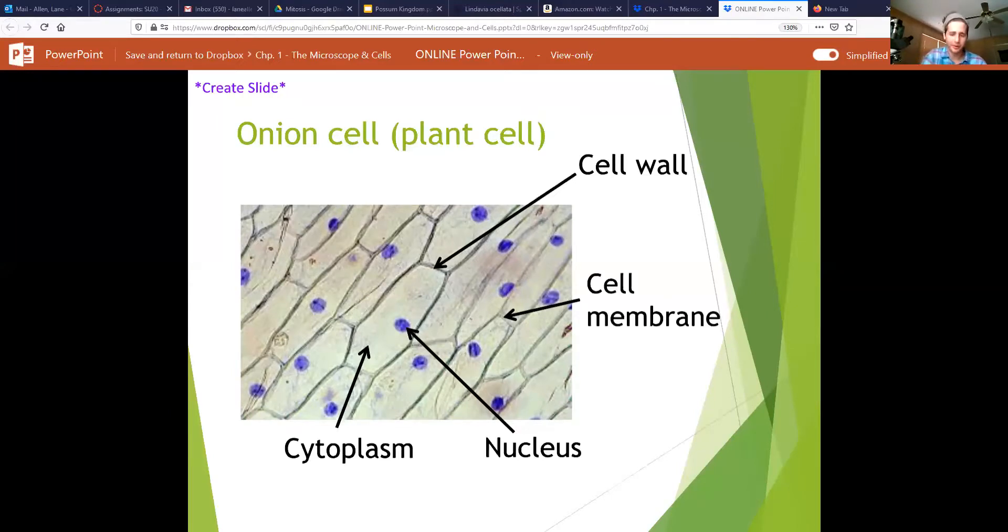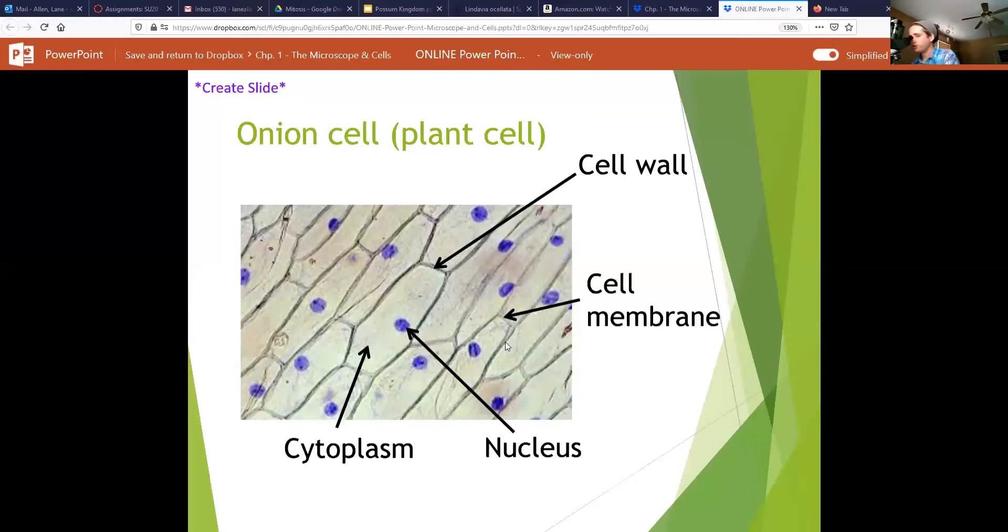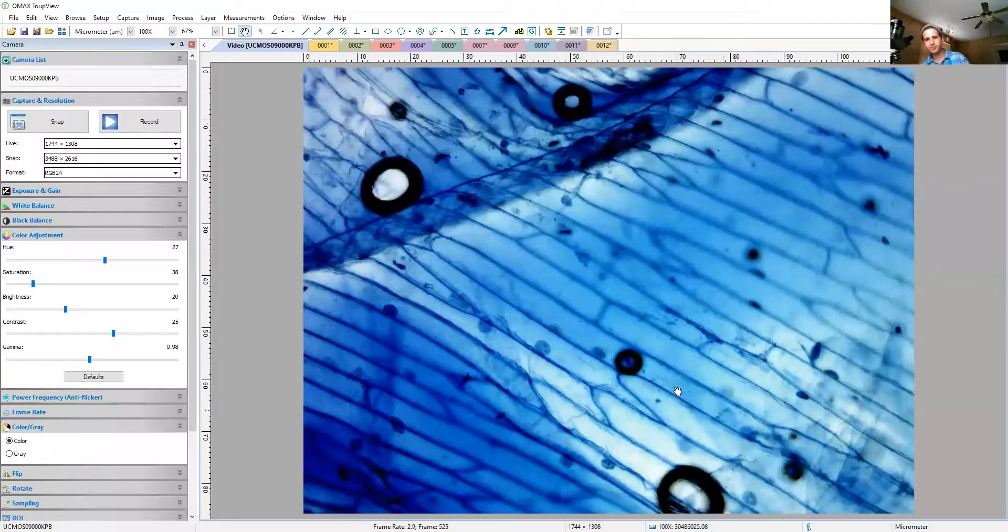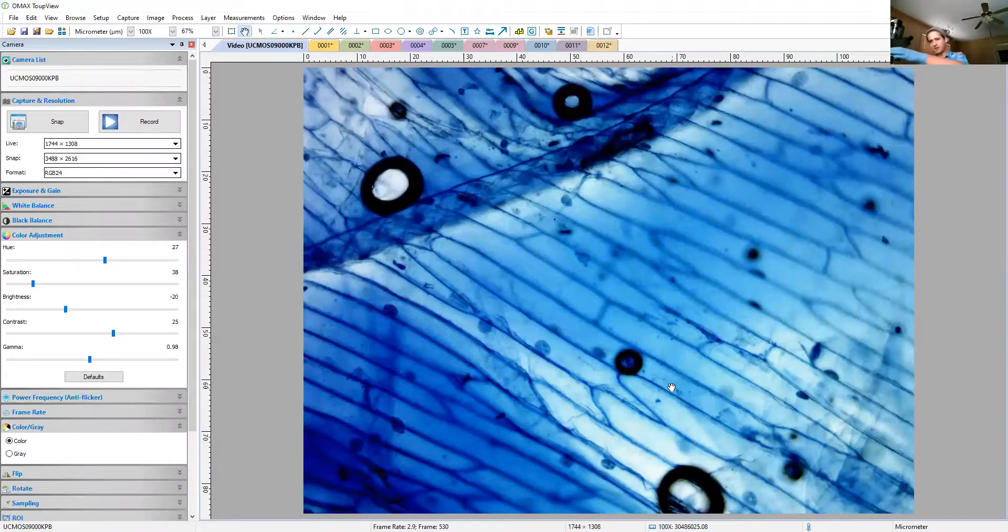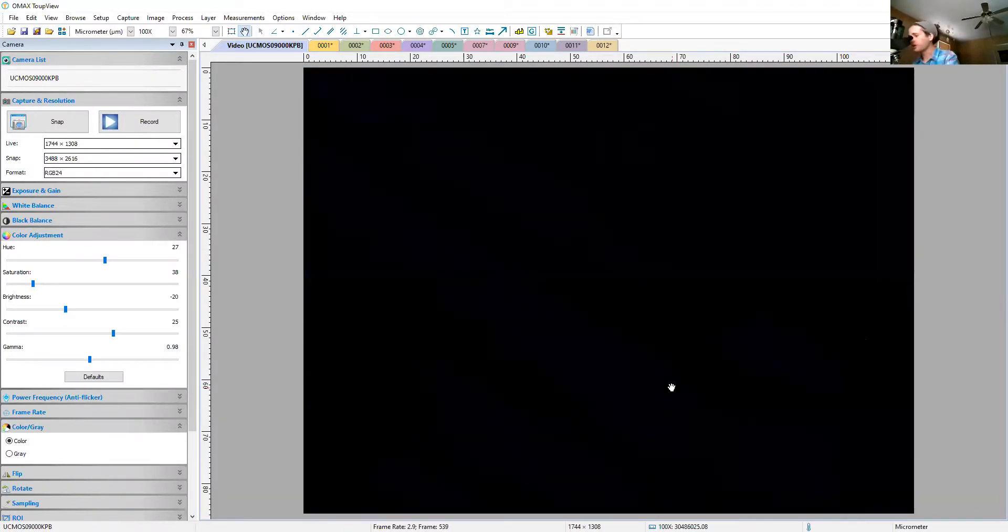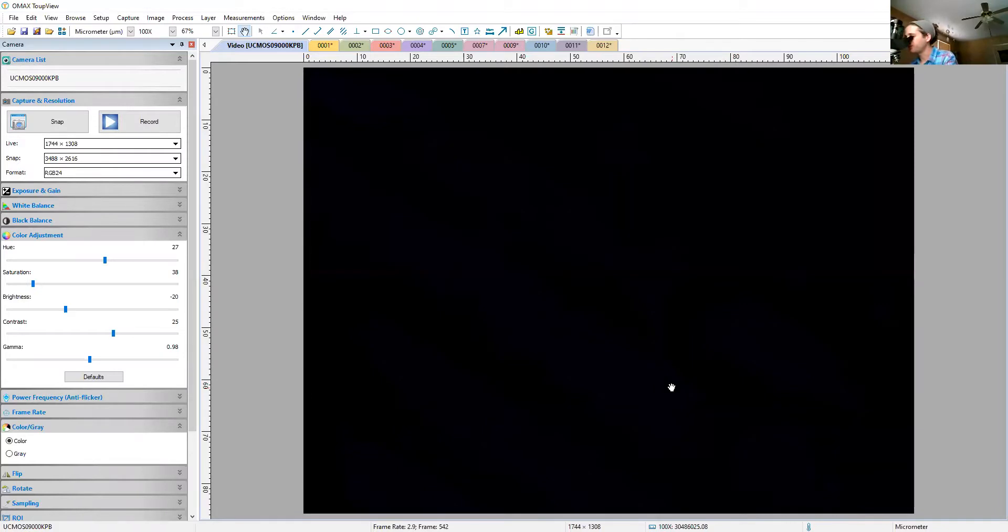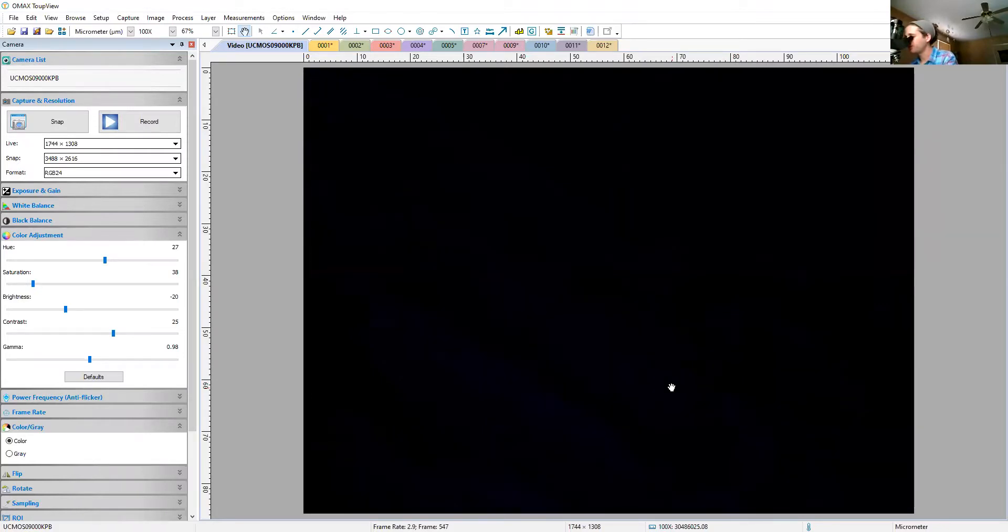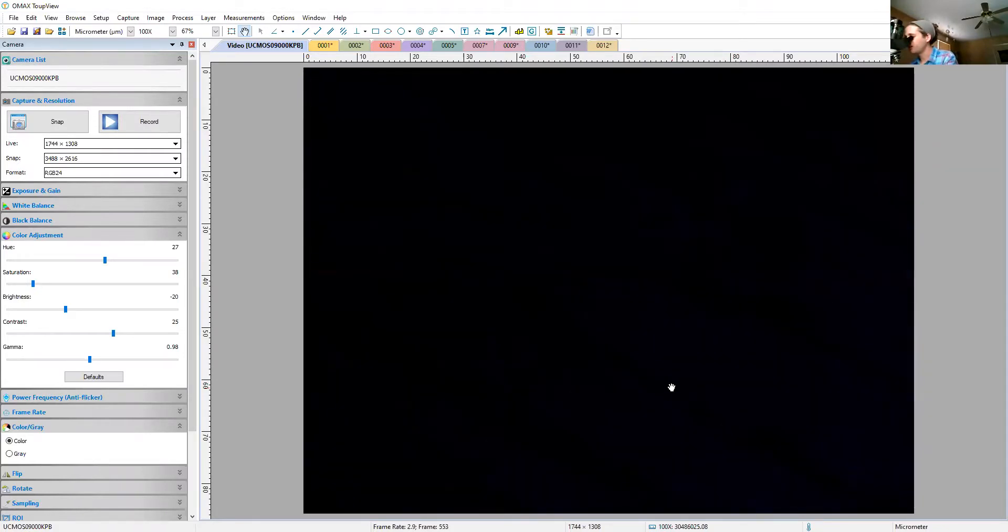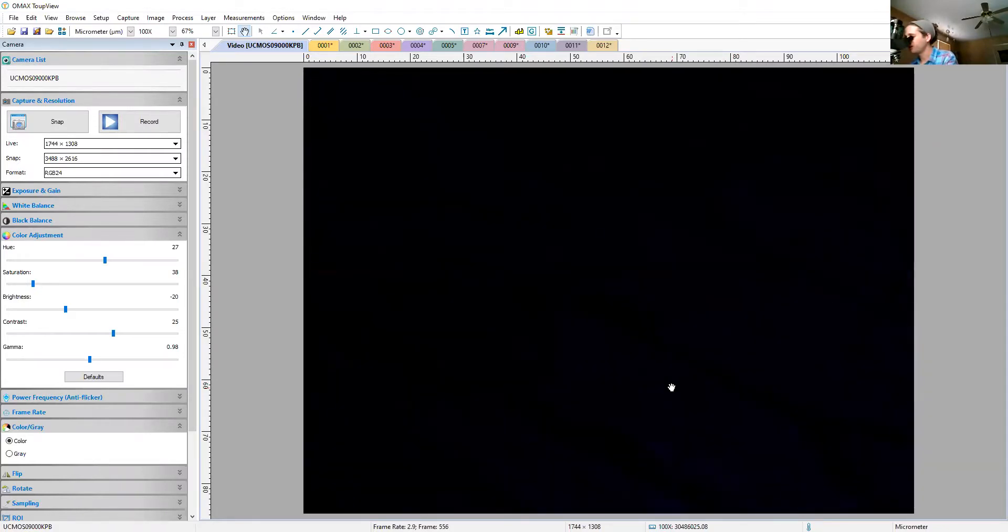Okay, so let's jump on over to our real-life view of our onion cells. Again, mine isn't staying in focus quite as nice as the ones in the pictures. That's all right. I'm going to have to increase brightness.